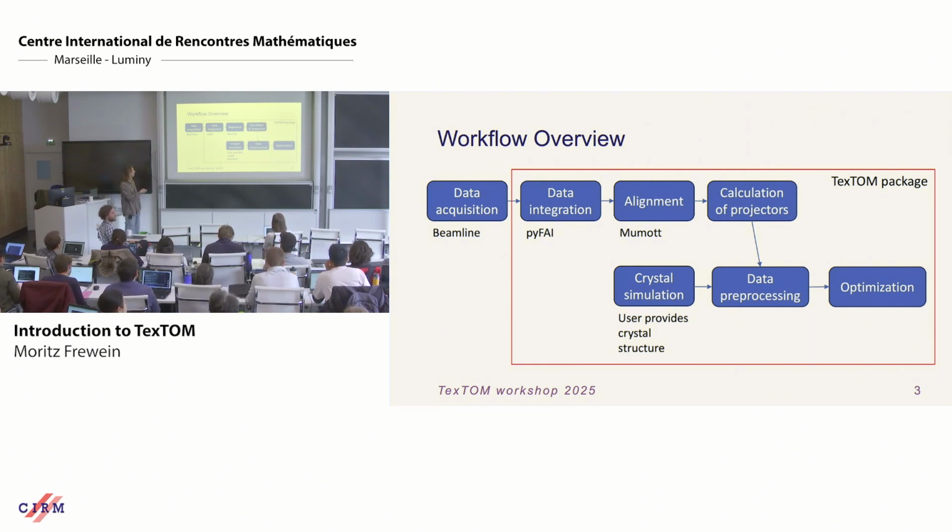We can do the data integration. It is currently implemented via PyFAI. Here, you can also use a different program if you want to, as long as you get the data into the right format.